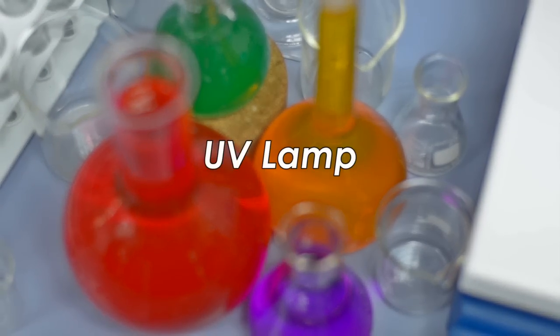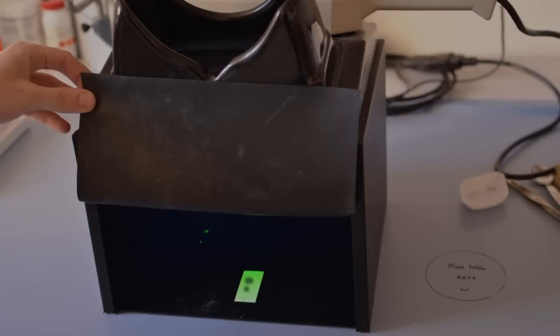For unsaturated compounds, this is a quick and easy technique. Simply put your TLC plate under a UV lamp and observe where any spots are situated.